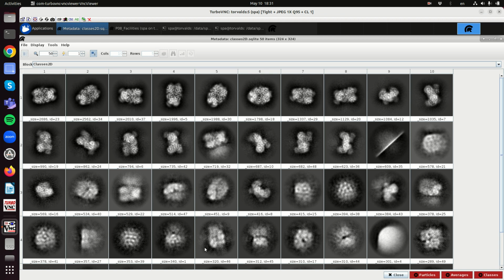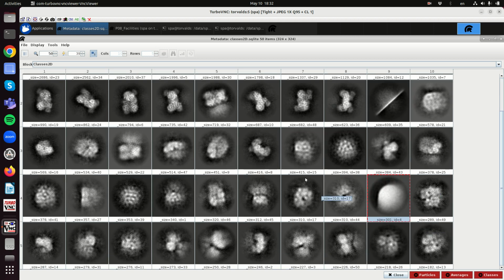So remember, this bad stuff has been found by some pickers. It has gone through the deep consensus. So this is just a reminder, all algorithms have false positives and false negatives, and there are particles that are particularly good at going through all these filters. Even this one has escaped all these controls. So, but still, all this up to here is fully automatic.